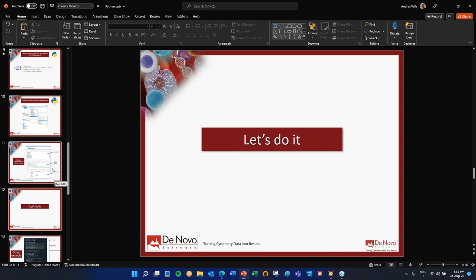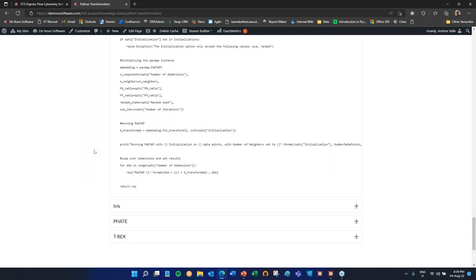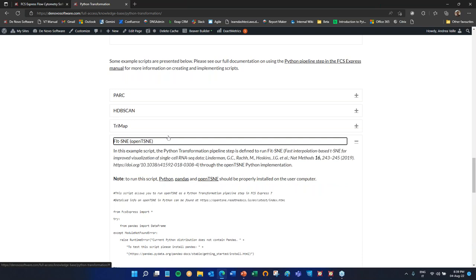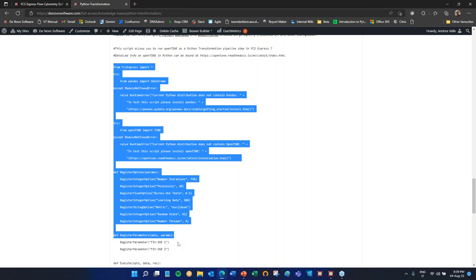Now you know how to do it and it's really easy. But I want to provide some more information — it's useful to go a little more in depth so that if you want to do something more than simply copy and paste, or discuss with your bioinformatician, you'll have more knowledge. We have a lot of scripts and I want to take just one as an example — FITsne. You can see that based on the indentation, the script is subdivided into different sections.